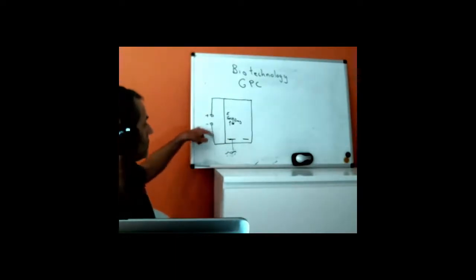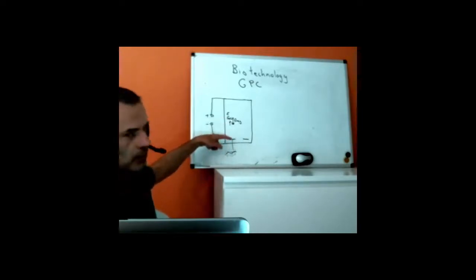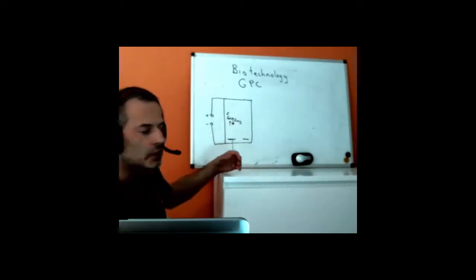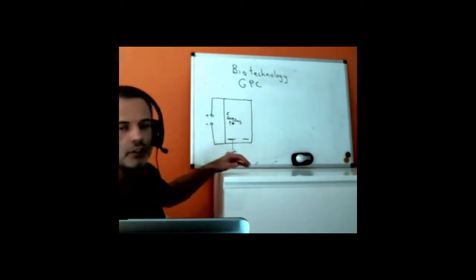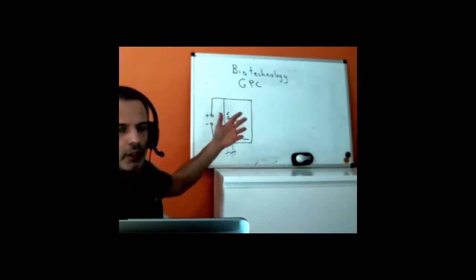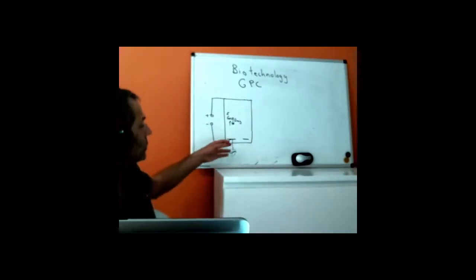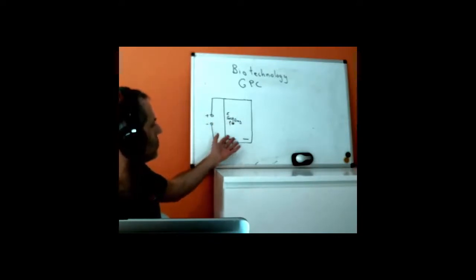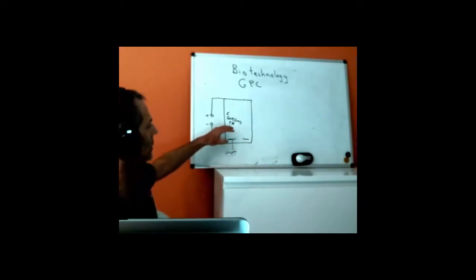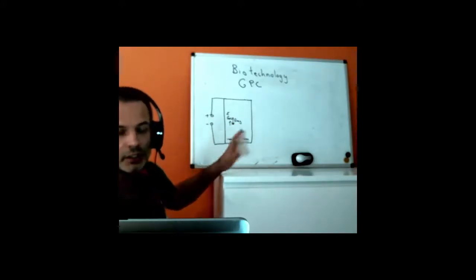So when we turn our electric field on, there is a force on the DNA molecules due to the electrical field that drags them in this direction, and there's a drag on them, which is the viscosity of the liquid and the gel. If we did this in a liquid, it would move as a blob and push the liquid around with it, so we need the gel there to prevent the chemicals from being able to diffuse together. That would cause a type of convection, a type of electrostatic convection, so we would pull our particles all up together and then we would get no separation at all. So what we need is the gel in there to prevent that. It also helps to stop the DNA from diffusing out and getting somewhere else.